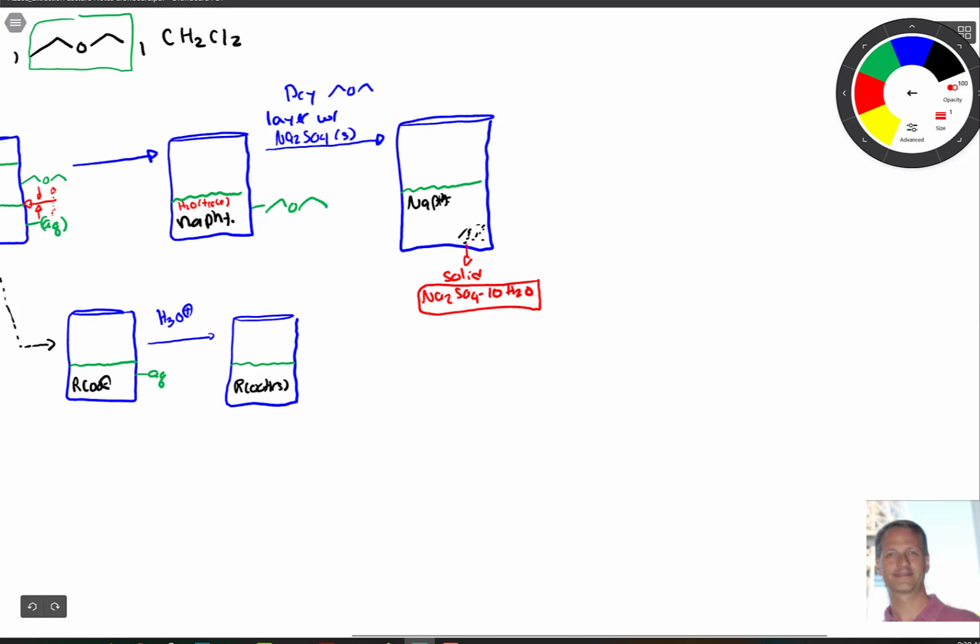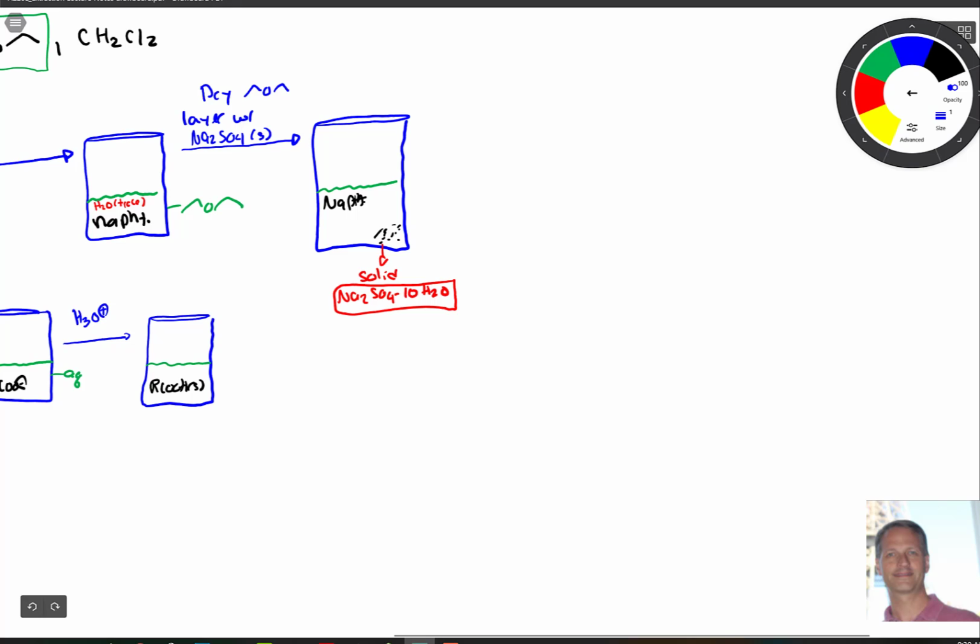So we're almost done. In order to purify our compound, you do a few things, and I'll just highlight this here for you. So number 1, you remove the solid Na2SO4. We usually do that by just pipetting it into another test tube or something like that. So we'll call this like via transfer. Okay.